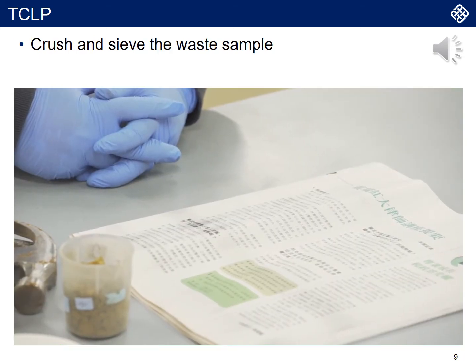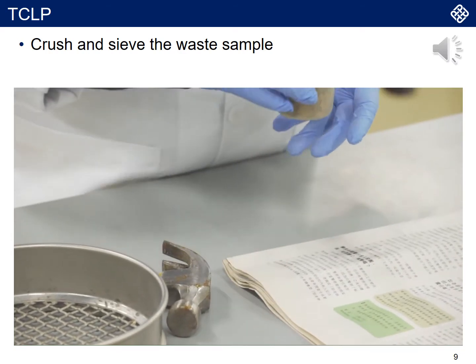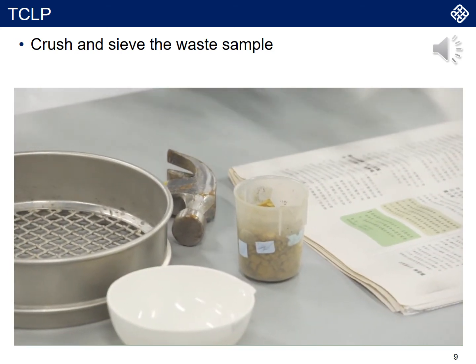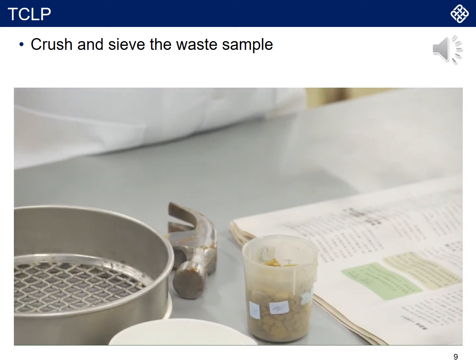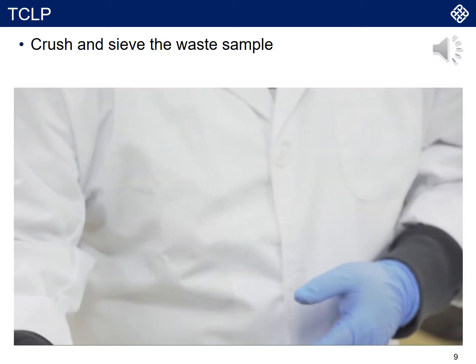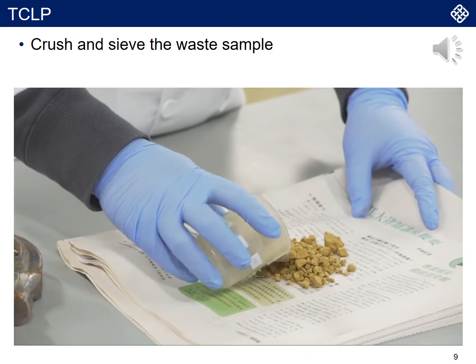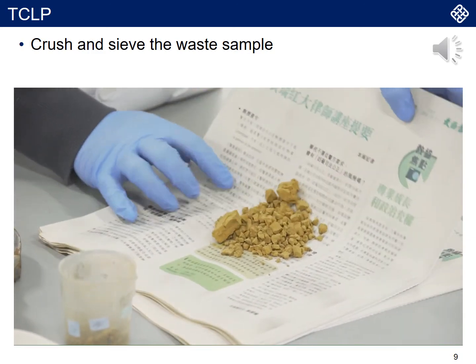Before we do the experiments, this page shows you how the sample has been prepared, and how we crush and then screen or filter to the particle size that we want. Because the sample that we are handling is a toxic compound, it is possibly a little harmful to the technician if we don't handle it well.